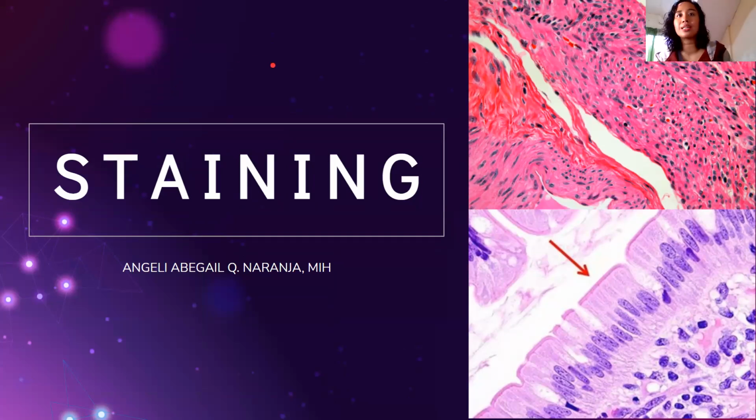Could I just show you a sample tissue of a slide stained with H&E? So this is a uterus. The uterus is filled with smooth muscles. Smooth muscles, guys, when stained with H&E, give a deep pink color. That's a brighter, more vivid pink when it's smooth muscle being stained. And the dark circles there are nuclei. In H&E staining, the nucleus results in blue-black.